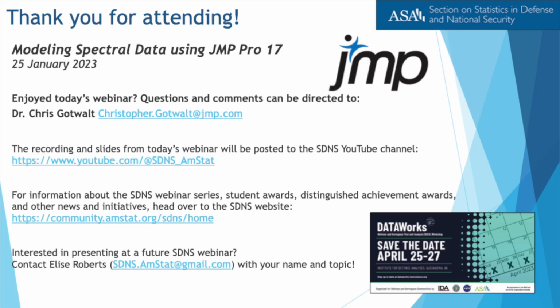You had mentioned the Ramsey book earlier. I know that there was a series of MATLAB scripts that are provided with that text. Is this the same? Is this different? Is this complementary? Well, we very rarely use any code that came from outside of JMP or SAS. So everything here, our wavelet transform, was developed natively.